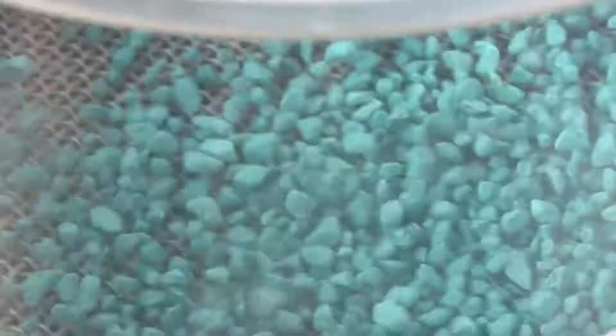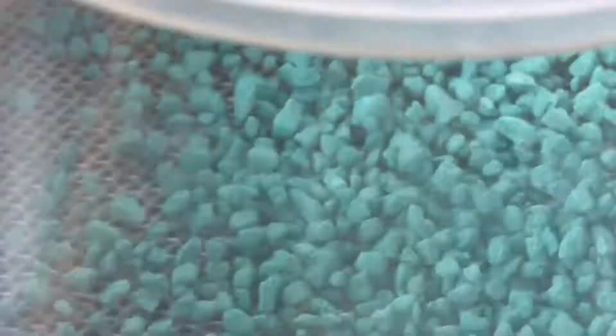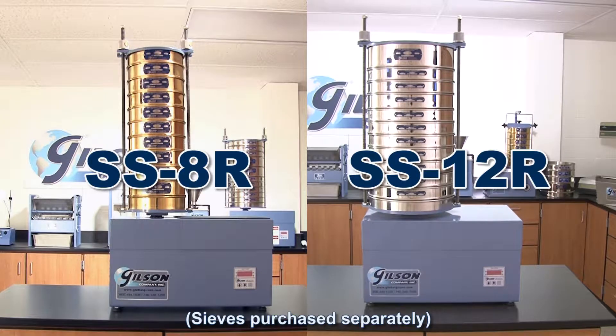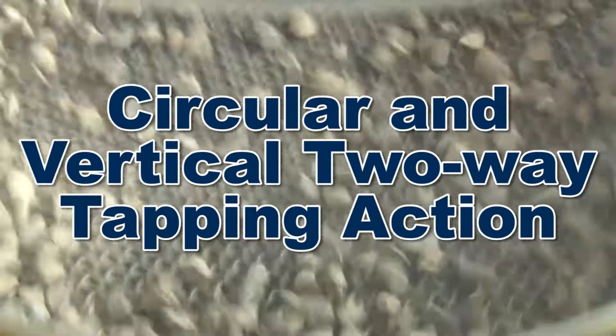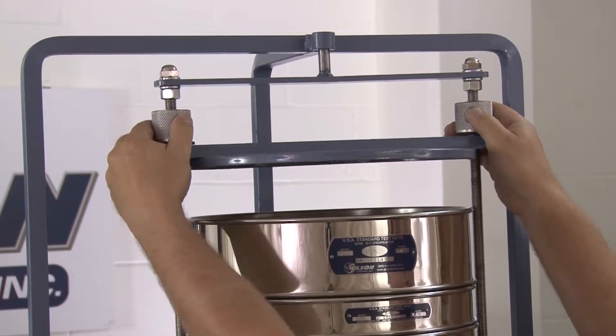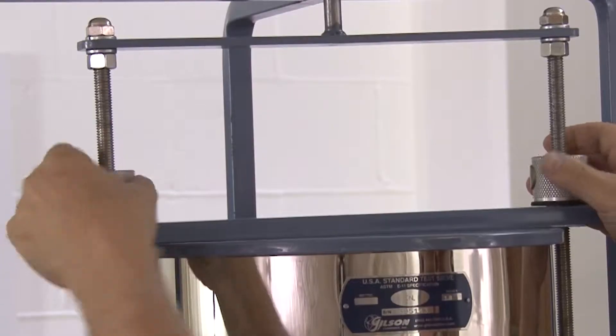Gilson's tapping sieve shakers combine tapping and circular action, like the Gilson SS8R and SS12R sieve shakers, with its circular action and vertical two-way internal tapping action, to reorient and assist in passing near-sized particles to clear the mesh. And the EZ-Clam system allows for effortless securing of the sieve stack.